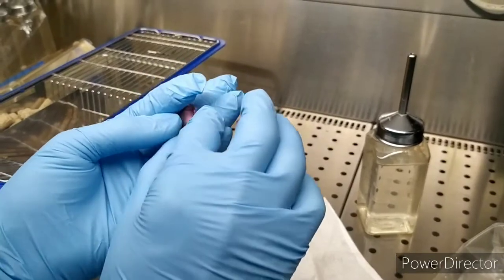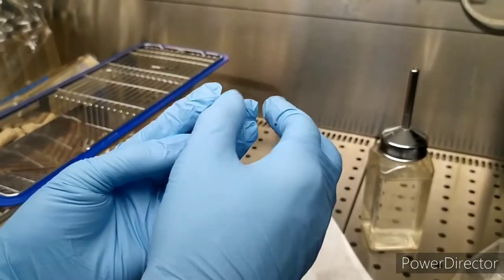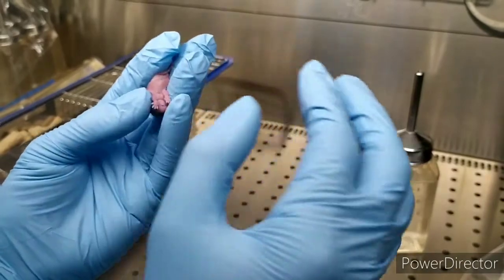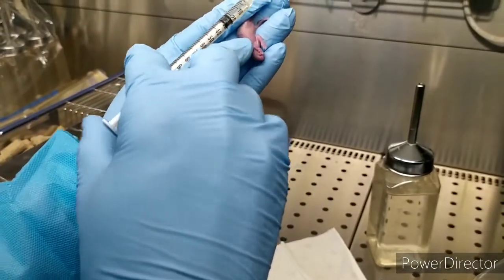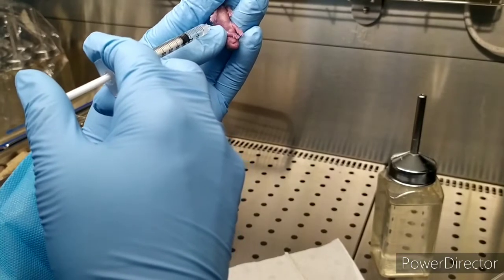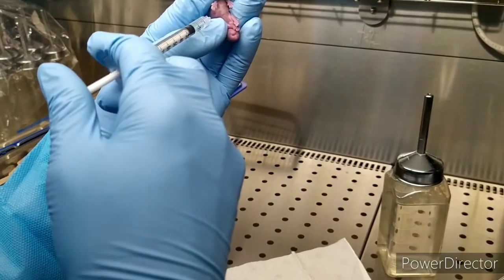Do not use too much here. Fix the leg right there. Now you kick the needle. Can you see the stomach? It's a little bit hungry, but you still can see the white color — the milk. Hold the control and check. One, two, and a half.